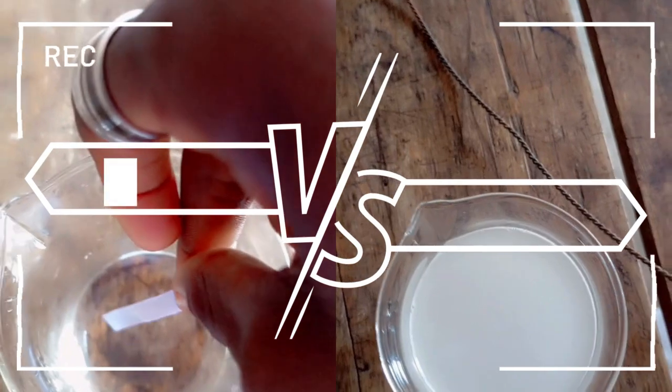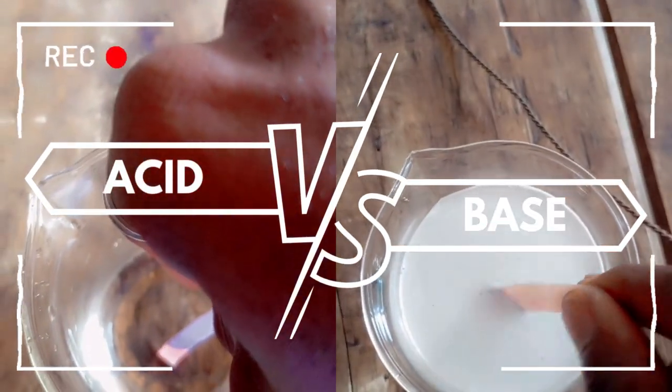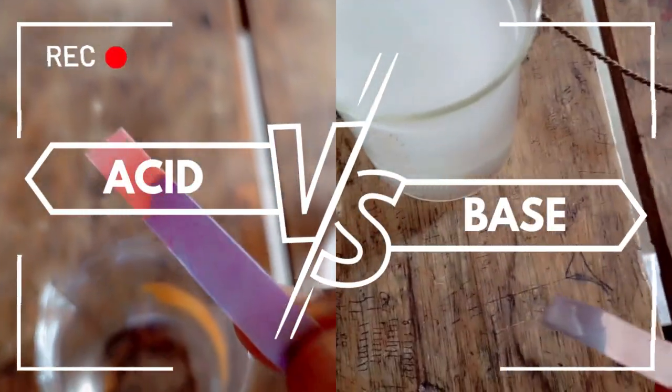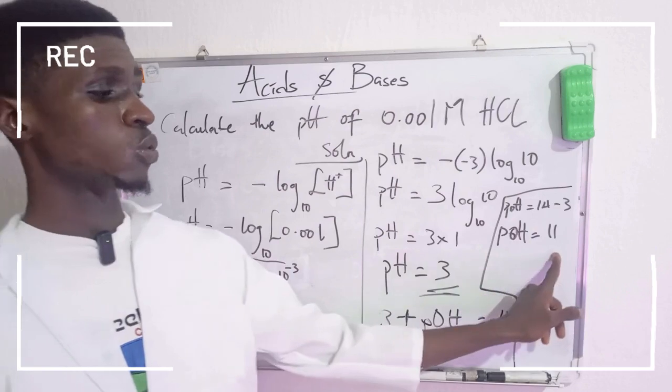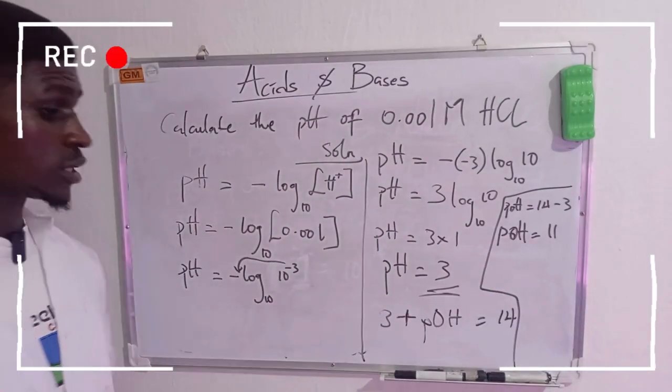You're about to watch a simple demonstration on the litmus test for acid and base. Secondly, you are going to see a detailed explanation on the topic acids and bases. Then lastly, we are going to see a simple calculation involving the pH scale.